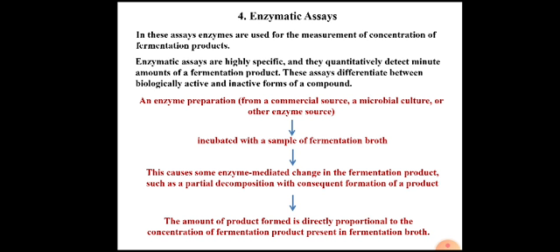Then the amount of product formed is measured by a spectrophotometric assay or some other assay. Then the amount of this product formed is directly proportional to the concentration of fermentation product present in the fermentation broth. That is the principle and protocol of enzymatic assay.